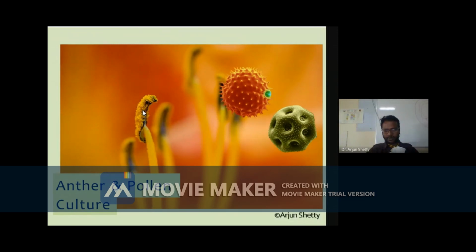electron microscope. In the previous semester, you went through different types of microscopy: transmission electron microscope, scanning electron microscope, and compound microscope. There are different types of electron microscopes, right? When we observe this powdery mass in the scanning electron microscope, you are able to see a structure like this. Just out of curiosity, I would like to tell you that this is the structure of the pollen grain of marigold.